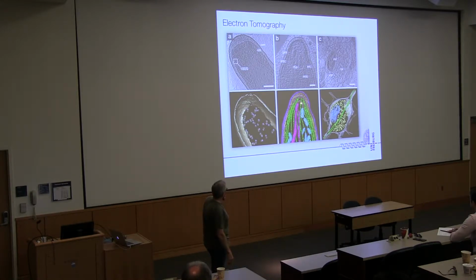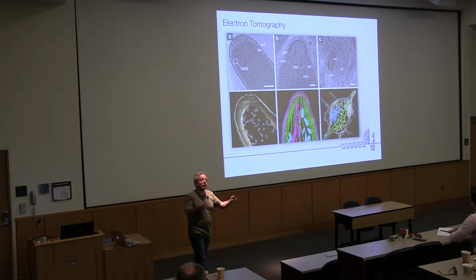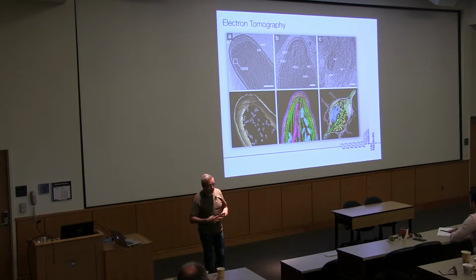And then, of course, on a computer, you can color this accordingly to visualize membranes and cytoskeletal structures, mitochondria, vesicles, these kind of things, filaments. And of course, if you get better and better, you even start to be able to visualize protein complexes. So that's one thing. That's cellular architecture. That's not very much of function, if you ask me.